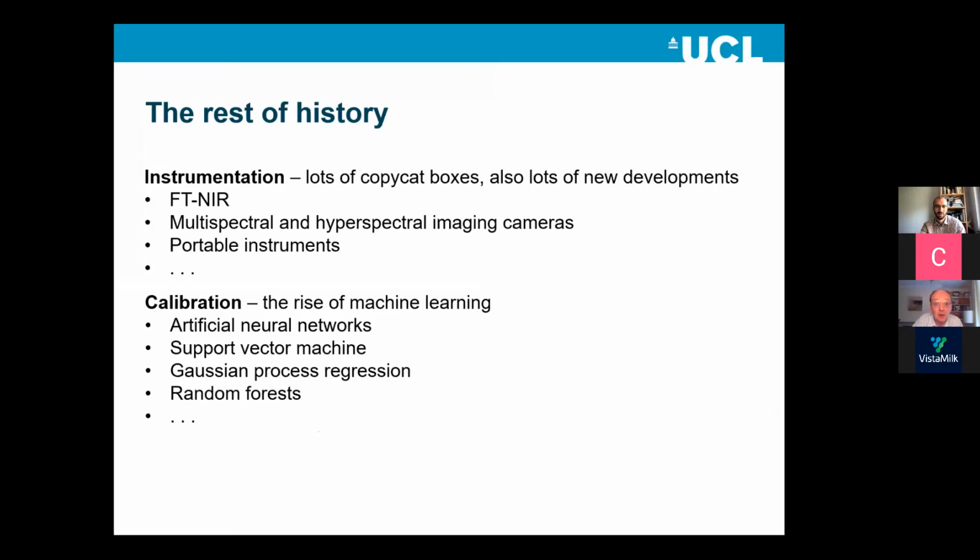Okay, let's move on to the rest of history. So the rest of history is less interesting. Lots of copycat boxes, so lots of instruments that basically did the same job. There are a whole range of filter instruments with various numbers of filters in, and then other technologies that would give you the same sort of information. I guess the important developments that were not incremental, which changed things a bit.